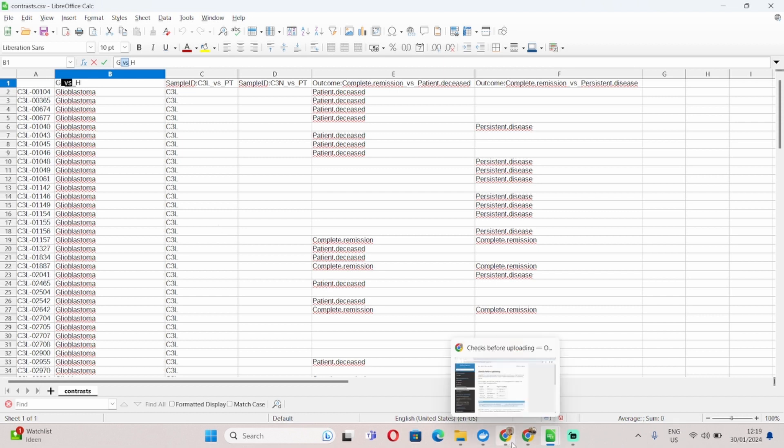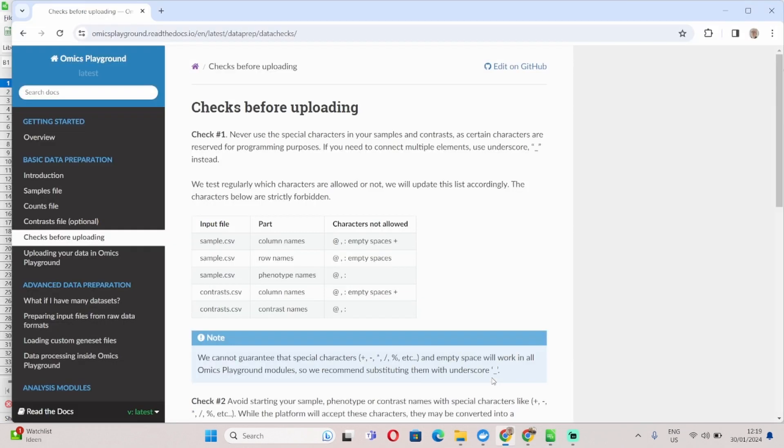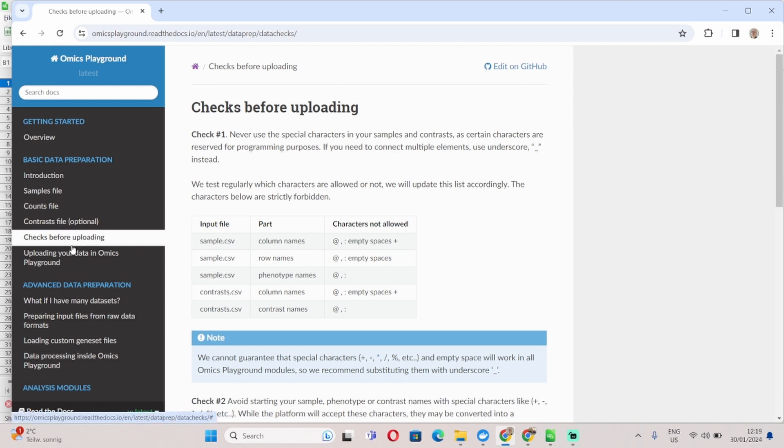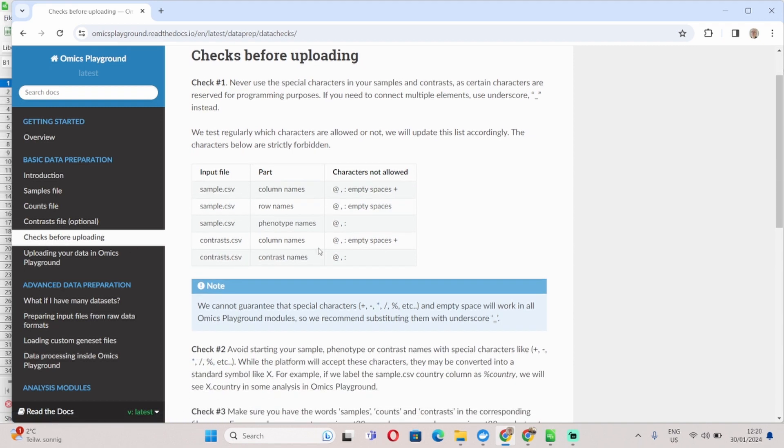So for the final part of this video, I'm going to direct you now to our documentation, which you can find here, and specifically to the basic data preparation documentation. This is where you can find more details about how to prepare your input files, and in particular if you go to the section checks before uploading, it will tell you which special characters are allowed and which ones are not allowed for the different input files.